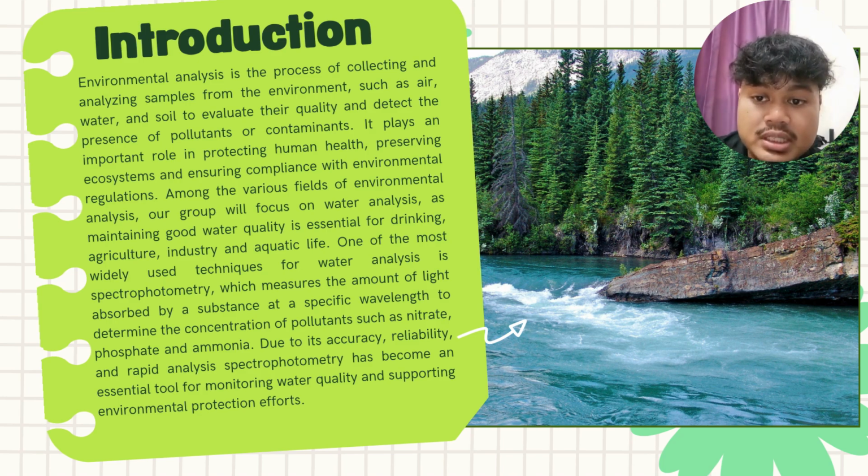Due to its accuracy, reliability, and rapid analysis, spectrophotometry has become an essential tool for monitoring water quality and supporting environmental protection efforts.